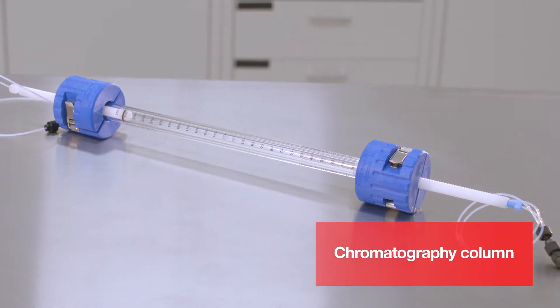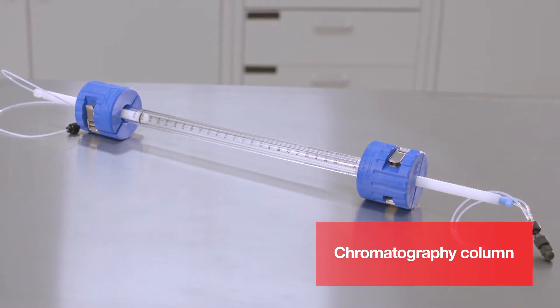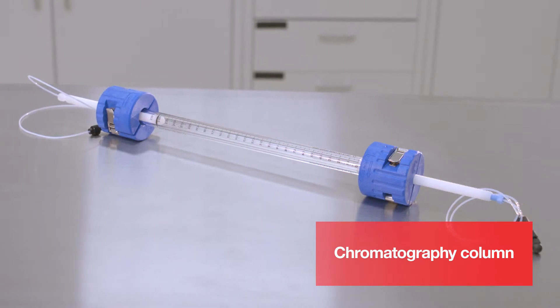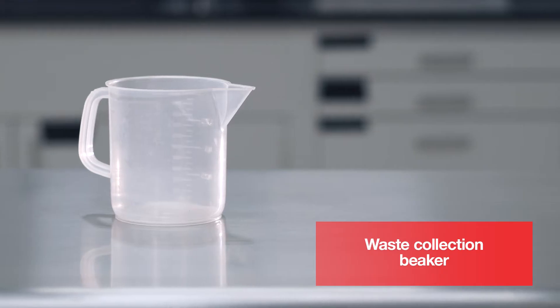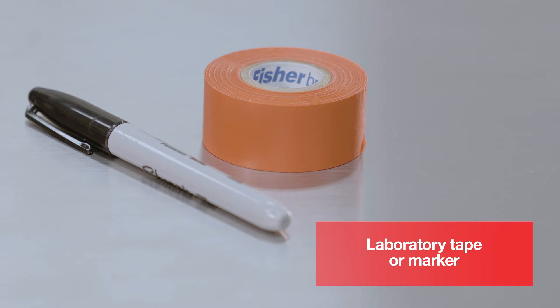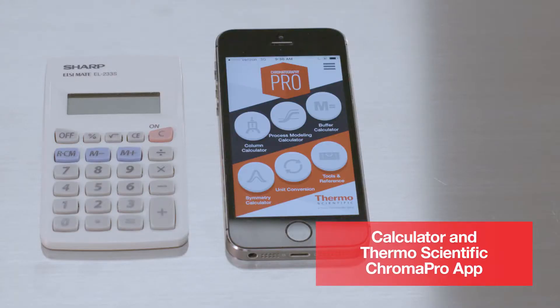In this video we will be utilizing a 1 centimeter diameter Essential Life Solutions snap column. Any commonly used column hardware may be used with POROS resins. Additional items needed include a column extender, plastic spatula, waste collection beaker, level, laboratory tape or marker, pipette, calculator, and the Thermo Scientific Chroma Pro app.